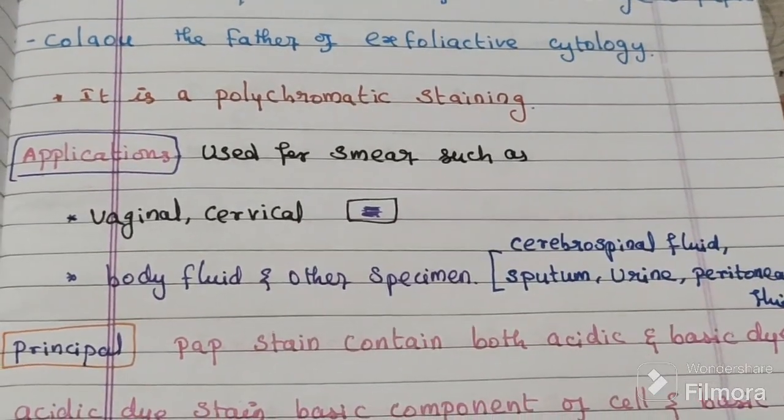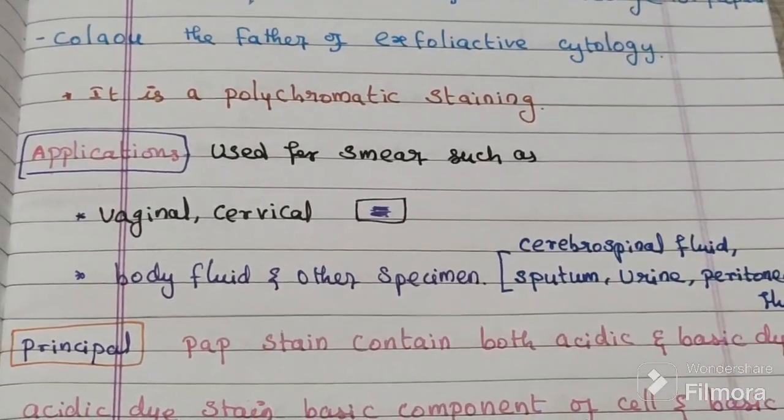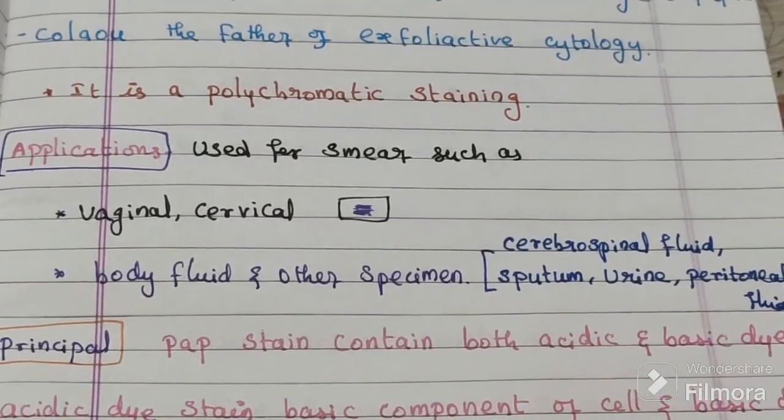So it is a reliable technique in cervical cancer screening.